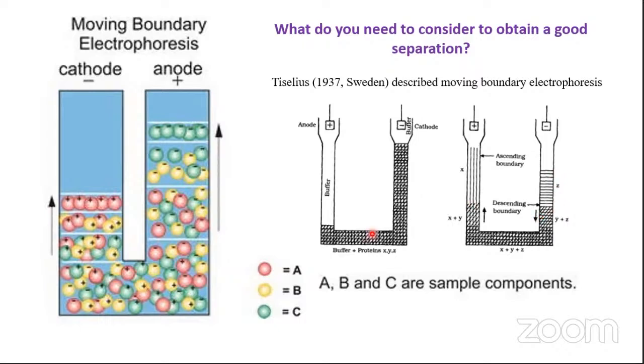So all in all, it's a difficult way in which you can detect whether the separation has taken place or not. This is important because you need to know when to turn off the apparatus, right? When you are carrying out electrophoresis, is it not essential, according to you, that you should know when to stop the process? Yes.